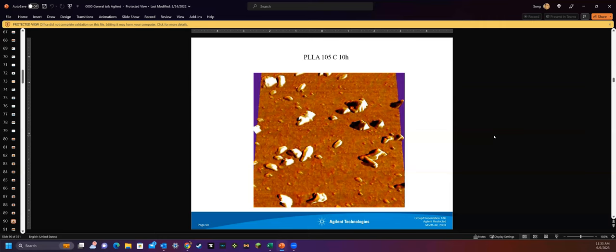For example, you should not use a double side tape to fix your sample on the surface when you do STM. Of course you can, but the soft double side tape is a very important source of drift. So if you're using a hard contact, using a spring loaded clip to push the sample down to a hard surface, that'll get rid of the Z drift. And then sometimes you cannot avoid a drift, you have to compensate the drift. In other words, you should open your motor tab, and then using the motor click to increase or decrease the sample height to compensate for the drift.